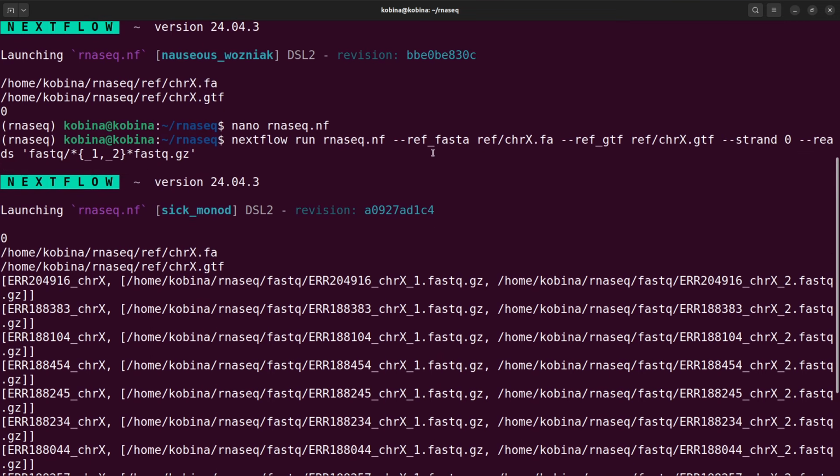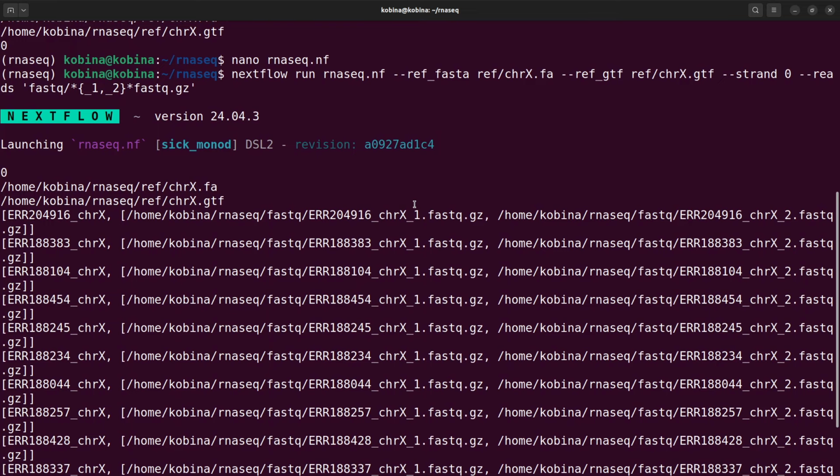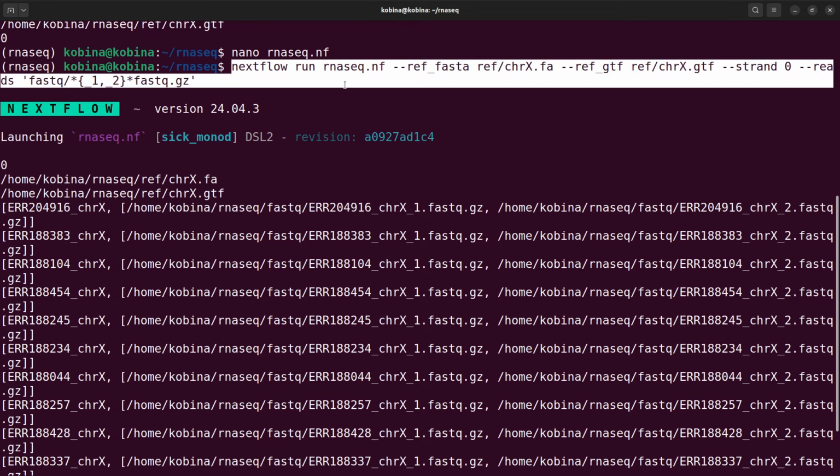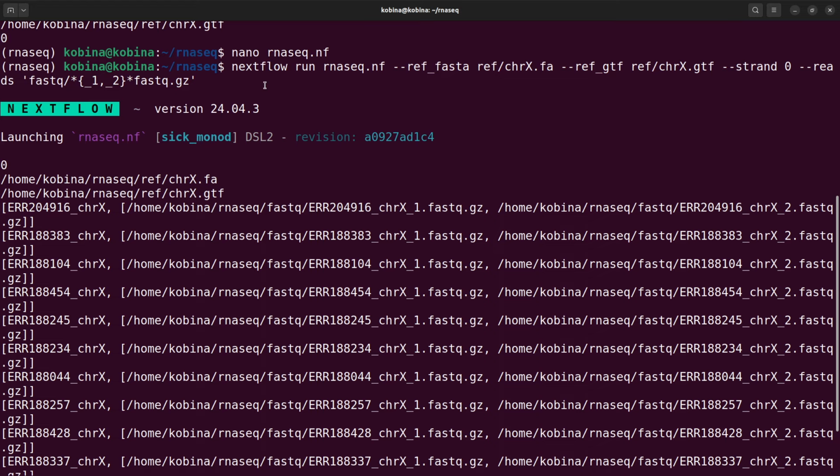Okay, so that's basically about it. So the commands we are going to be using, whenever I run Nextflow, I'm going to supply all these. All right, so take note of that. So I'll need fastq file, this and this. Of course, for some of the tasks that we are going to do, we don't really need to have all of them, but since this is a script that I'm designing in such a way that you have to supply all the information and it does everything for you, we are always going to be running it this way. All right, even though when I'm testing, depending on the process, some of the inputs may not be used, I'll still run everything in this format.